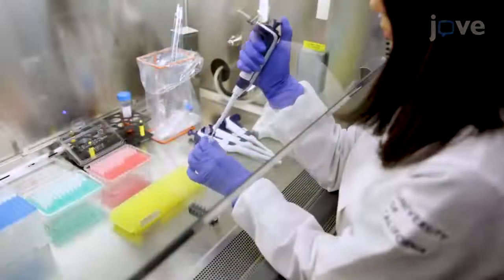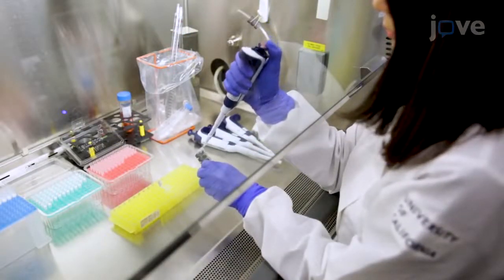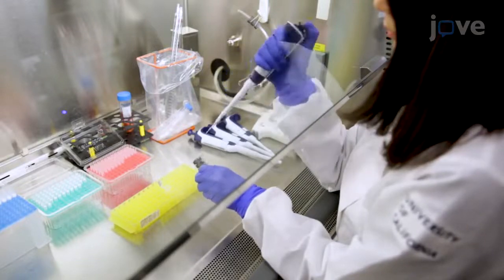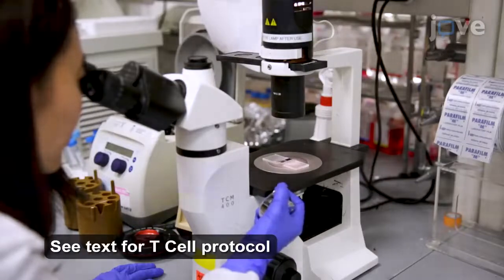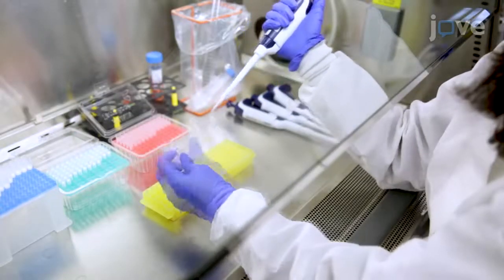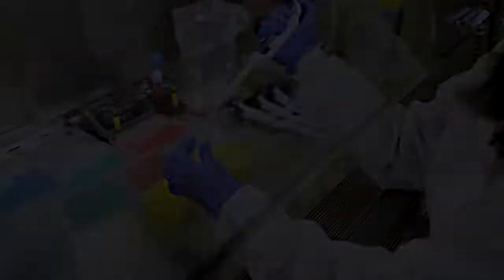Next, add 10 microliters of RNP to each cuvette well. After preparing HSPCs as described in the TEX protocol, count the cells with a hemocytometer and transfer 150,000 to 200,000 cells per cuvette to be electroporated to a centrifuge tube.